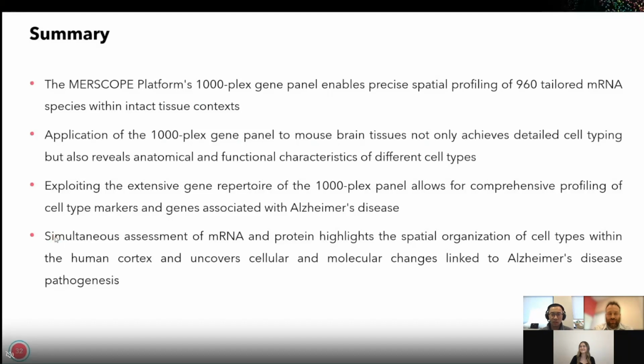I'm going to take this one. So for now, we mostly assign the transcripts adjacent to the soma to the segmented cell, because, as you know, in the brain the cell shape is very complex, especially including those axons and dendrites, and the cells in most cases are also packed very densely. So it's really challenging to segment transcripts that are distant from the cells. And even with tracing, you can hardly identify the axon or dendrite corresponding to each cell.